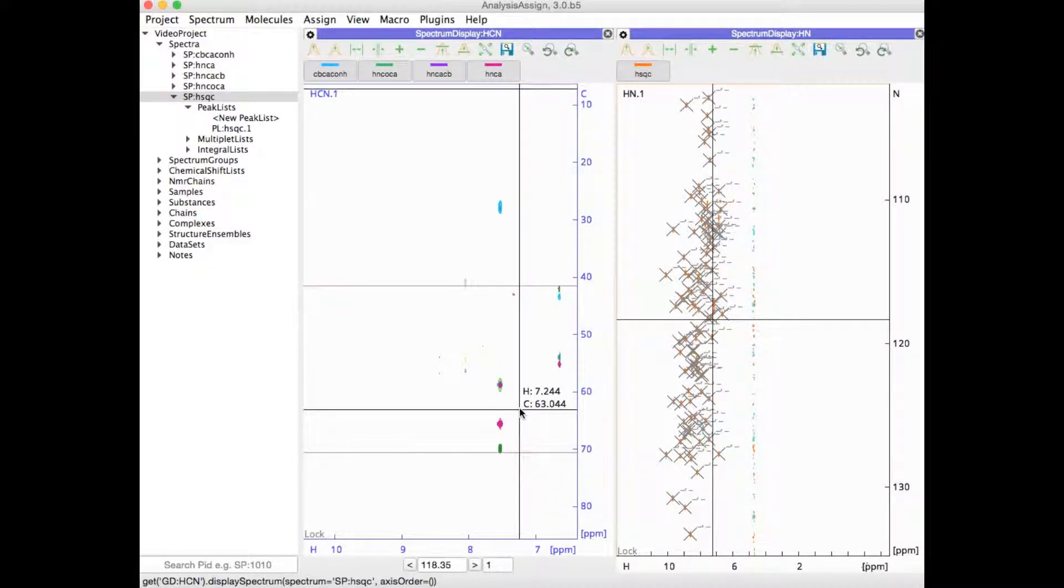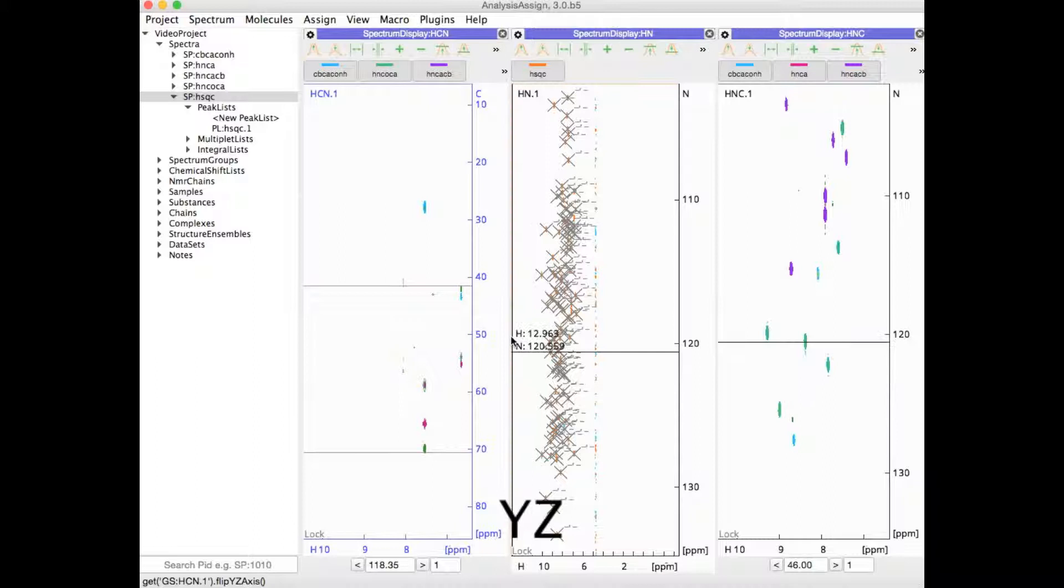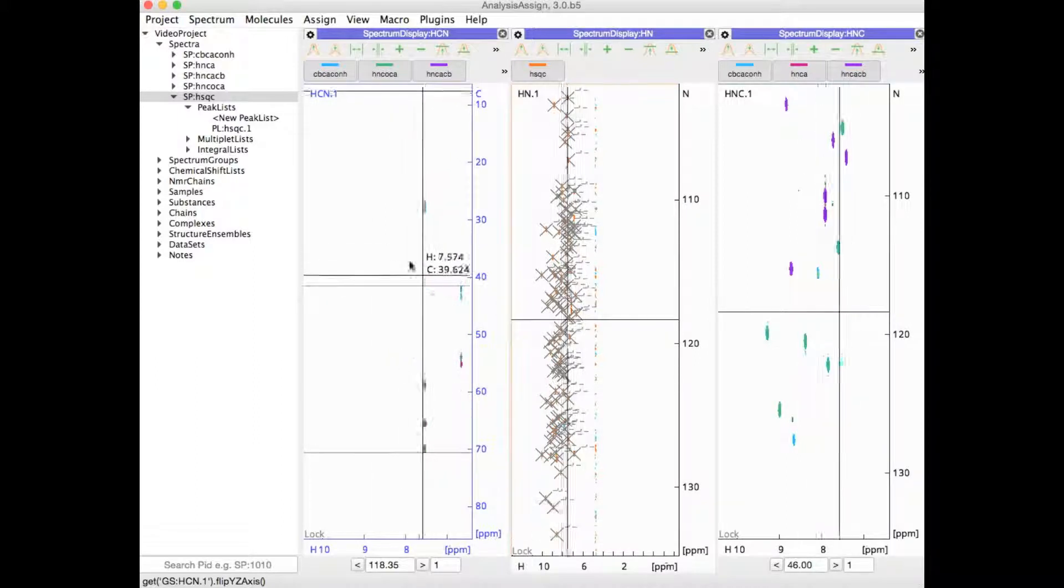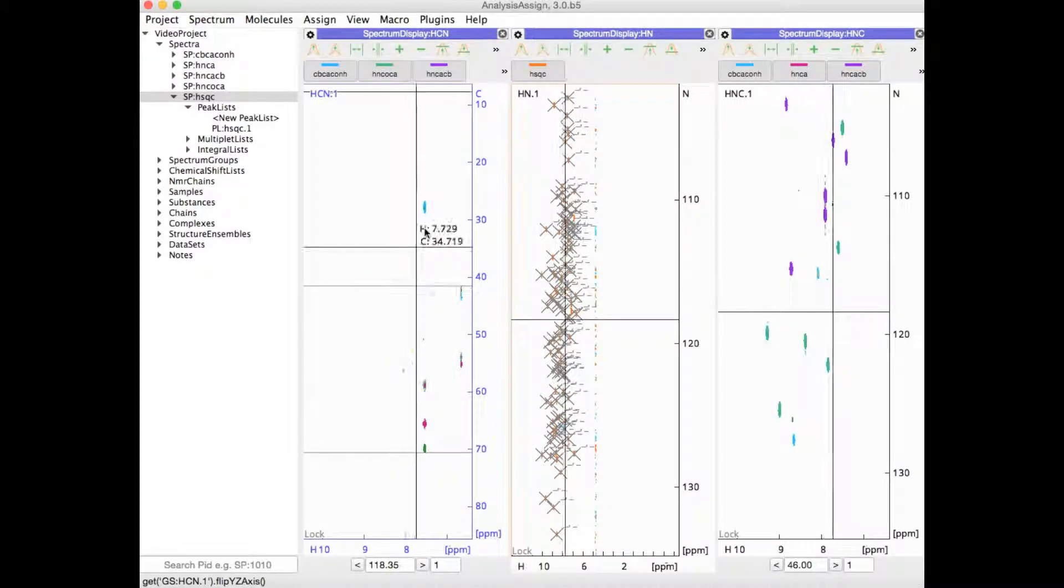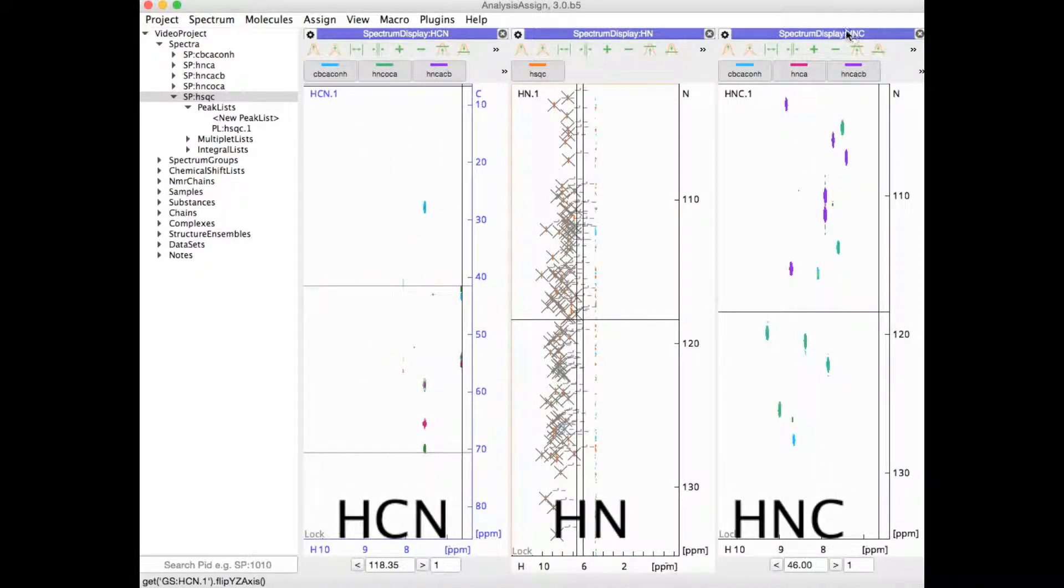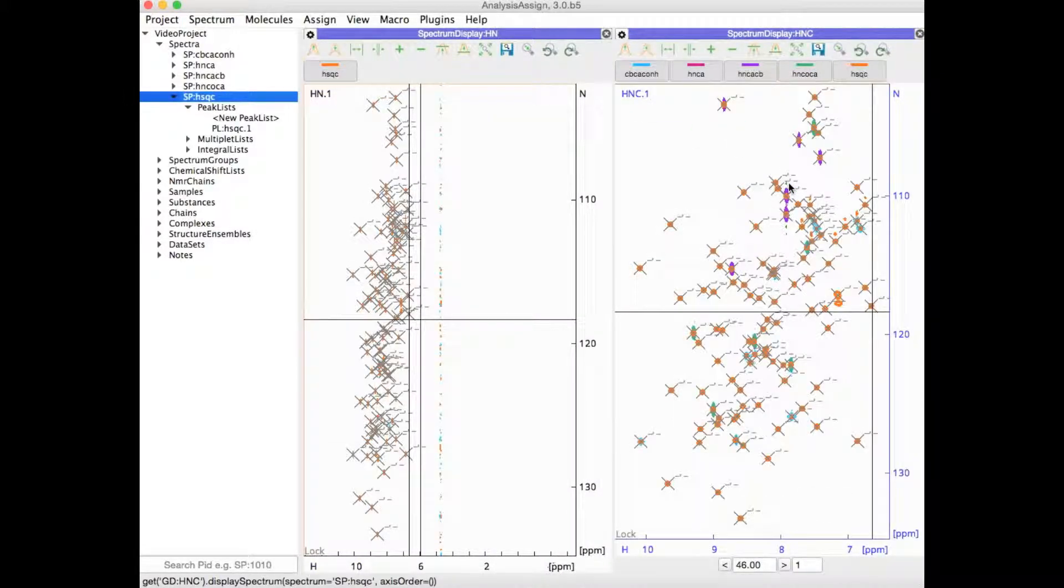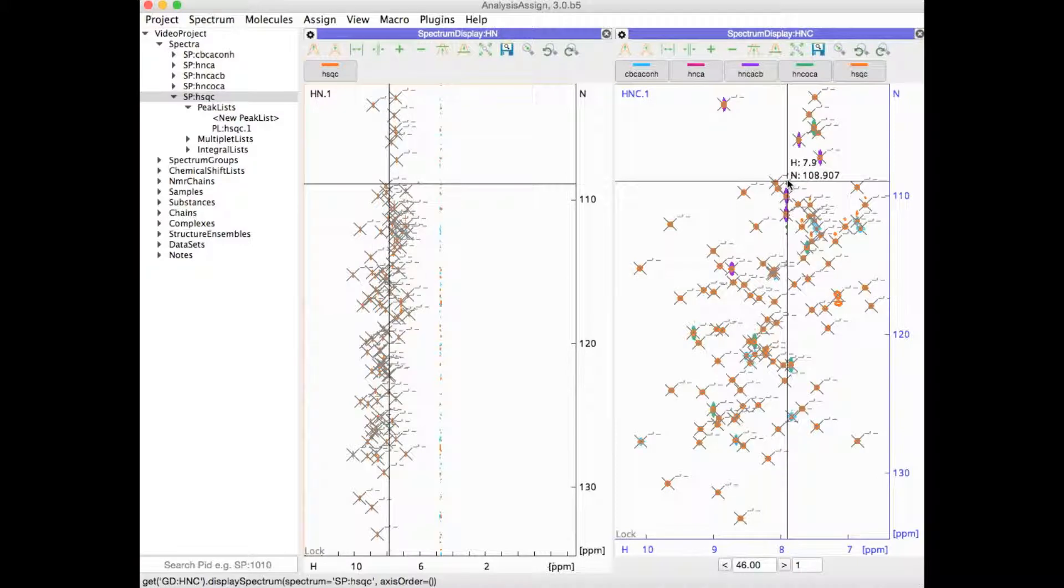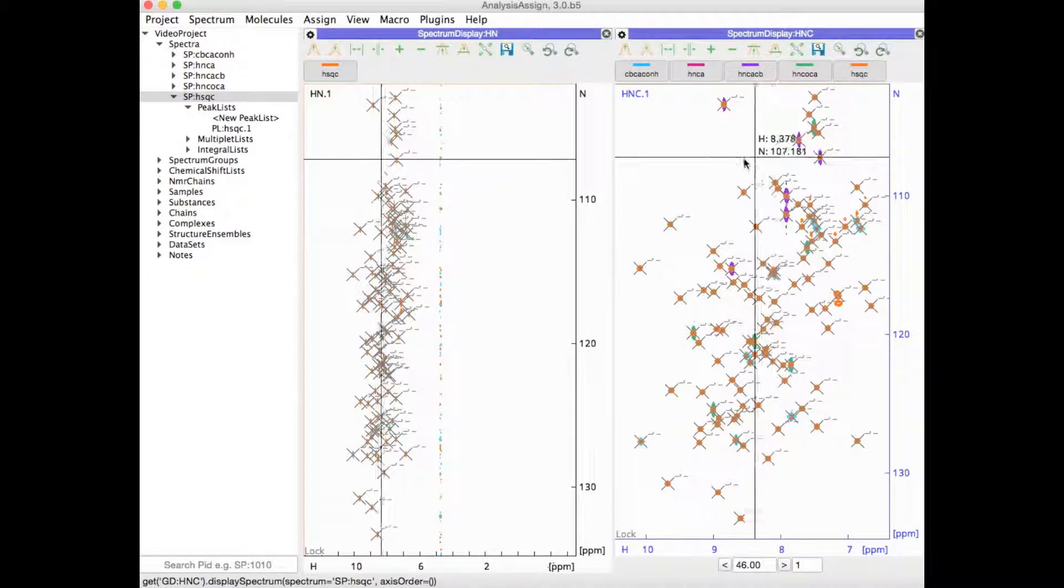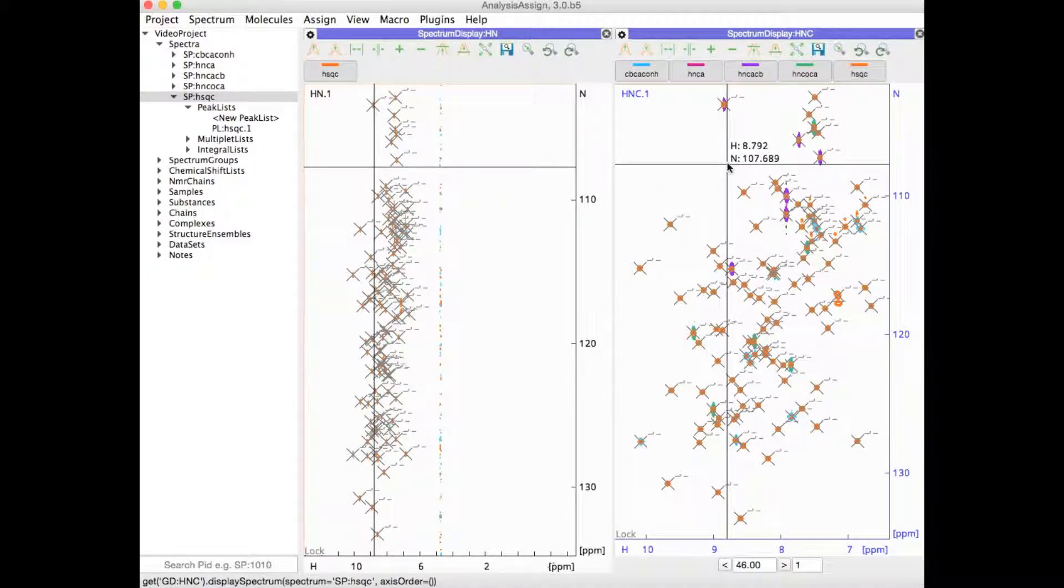If I now type YZ, I can flip this module and turn it into an HNC module. Now I can drag my HSQC into here. For more information on flipping spectra, see our separate tutorial on that.